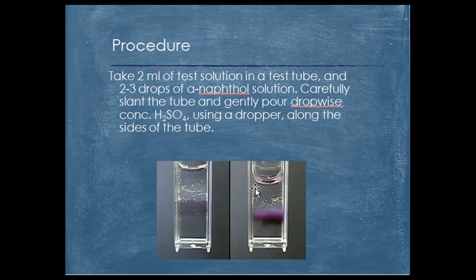This is how the result gives a positive test. You can see a purple color ring formed at the junction of the two liquids, which shows the presence of carbohydrate in the sample.